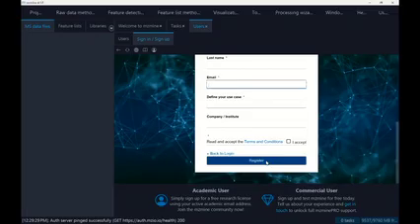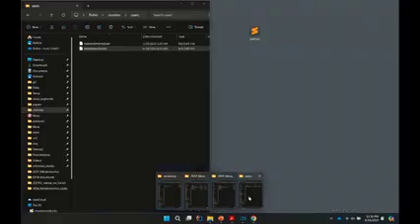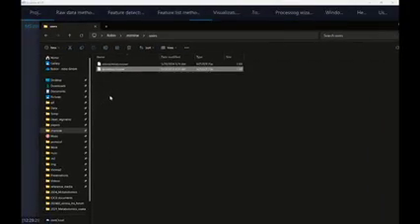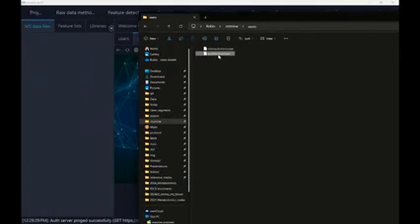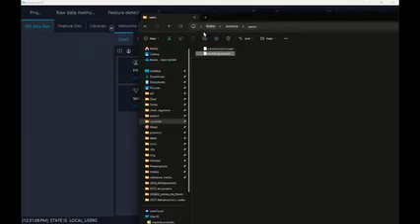You can try this now, but if anyone has issues with this, you can just download the user file, which is named workshop user, workshop.mzuser. I cannot zoom in here. I can just drag and drop this into MZmine, and it will then add the user to MZmine.